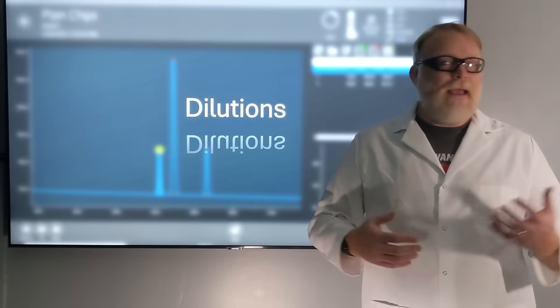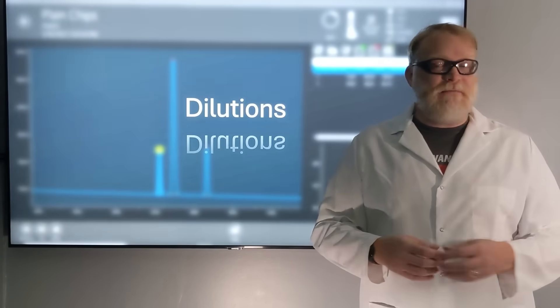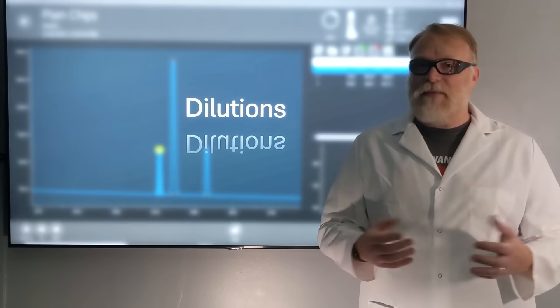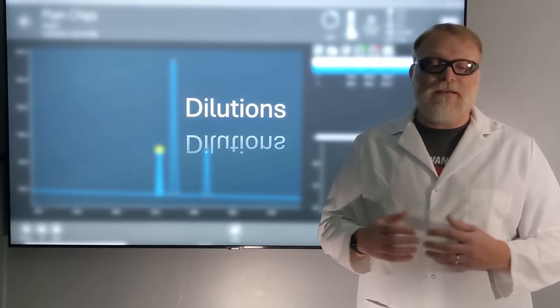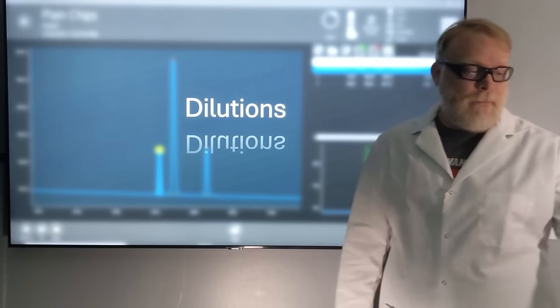Dilutions — what are they, how do I use them, and how do I perform them properly? Well, that's what we're going to discuss in this video.